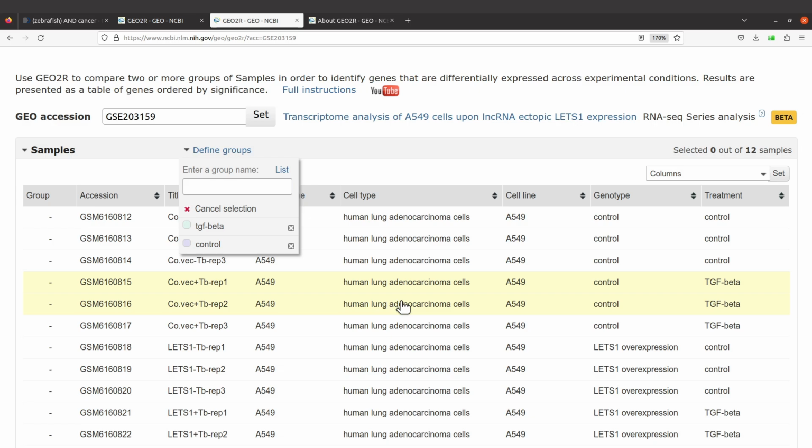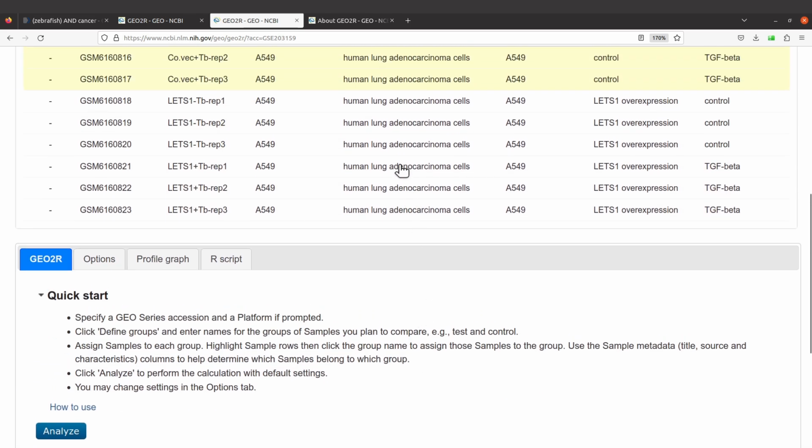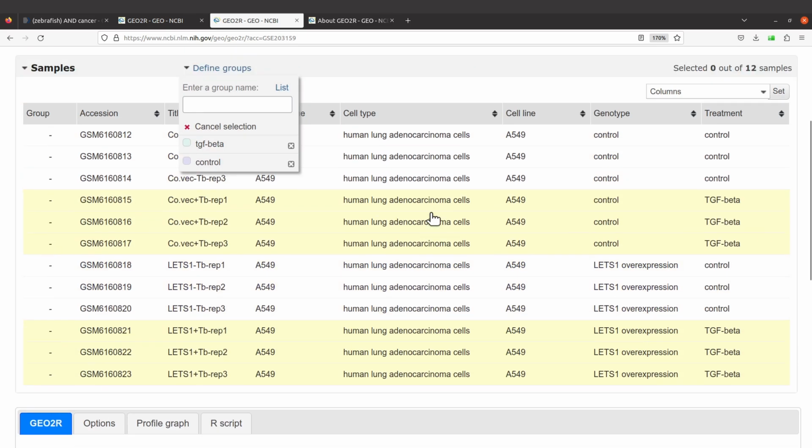So when a sample is selected, the highlight color will be this one here. It's orange or yellow or something like that. But you get the point. So you will see that the sample has been given this color. So now we have two samples selected. So let's select the other one, this one. Then let's select the other ones too. We have this, this, and then this. So we have all of them.